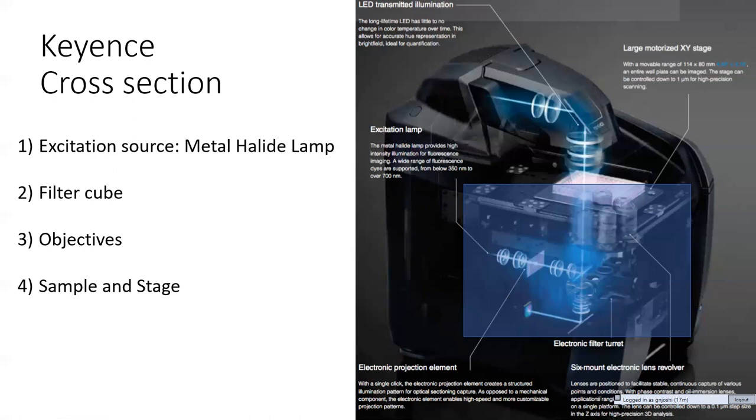The light gets reflected back, and we have a very versatile stage, which holds a bunch of different types of slides. And once the light from the sample goes back, it goes back to the camera for you to visualize your fluorophore or protein of interest, okay?